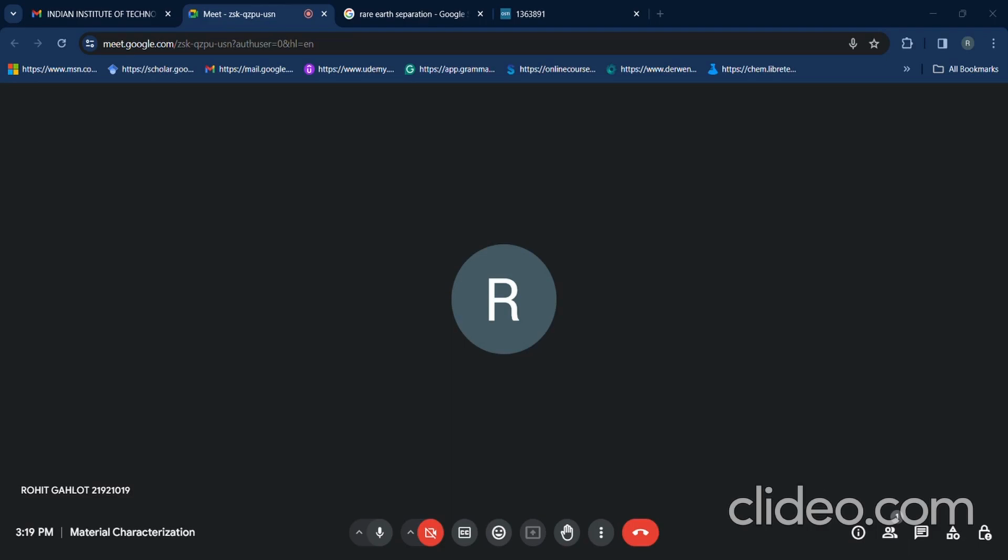And P is E by C, where E is energy. Then energy can be given as hc by lambda. If you consider it as matter, then energy can be written as h square by 2m lambda square. For the wave behaviors, images and diffraction patterns, the wavelength can be determined by the energies. And for the charged particle behavior, strong electron-specimen interaction, chemical analysis is possible.